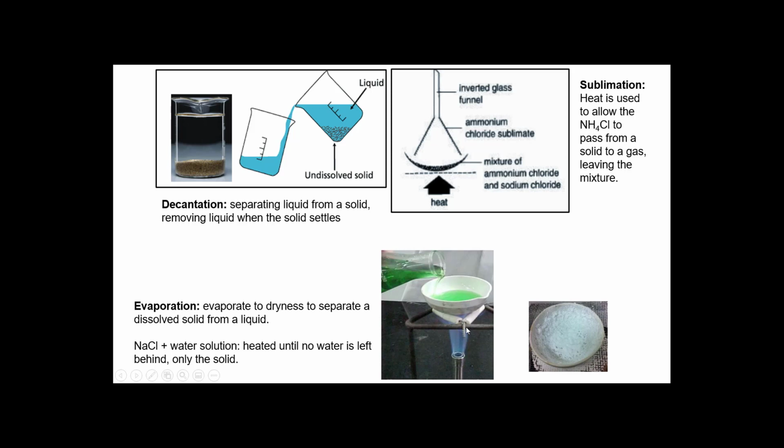and prepare to have it over the Bunsen burner. This will evaporate it away. Let's pretend this is salt water, NaCl and water, not ocean water. It'll be kind of clear, maybe a little white. And what it'll do eventually, if you evaporate it away, it's going to look like this. It's going to have salt crystals and all the water will be gone. So that would be evaporation. So you recover what you took from the extraction and remove the water again.